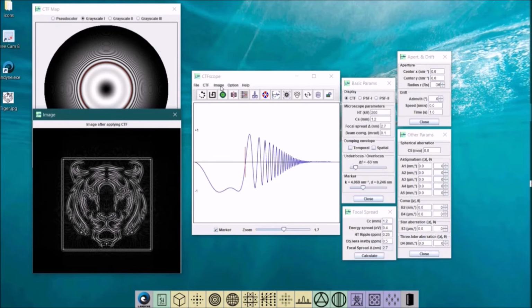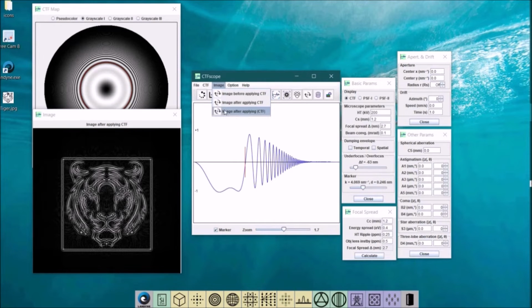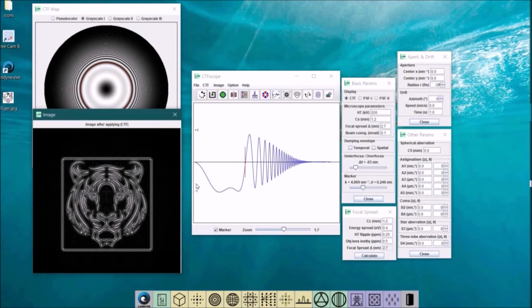And now we try number 2. Yeah, clearly it shows a little bit sharper than point spread function 1. So this is how, of course, you can bring in different images and have different values here to do the processing for tutorial purposes.